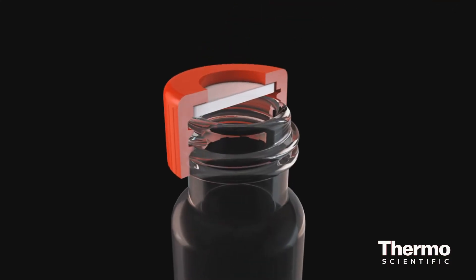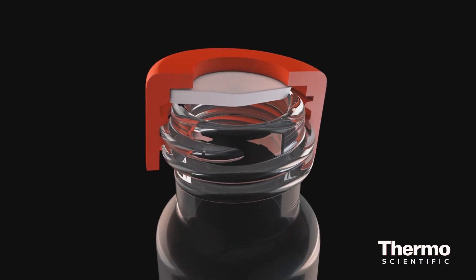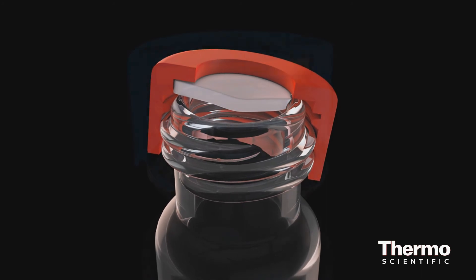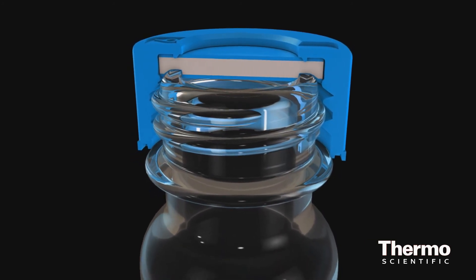Sometimes users have had a tendency to think that if they tighten that cap just a little bit more it's going to be even more sealed. What actually happens in this case is it can compress the SEPTA to a point where it can pull into the vial and it can also cause evaporation. With the SureStop vial, this sealing ring gives the user a defined pressure point knowing that their vial is completely sealed.